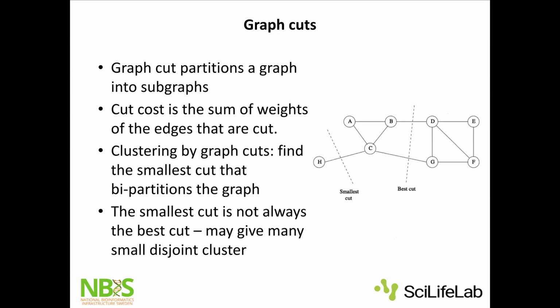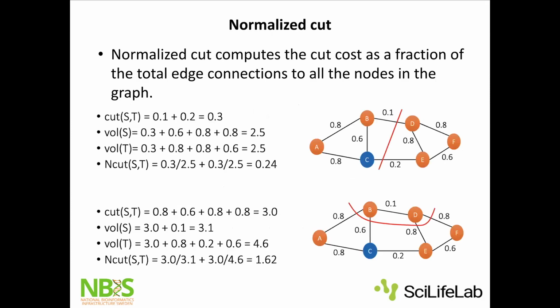Yes, we need to cut the graph. The cost of cutting an edge is basically the weight of that edge. And often the smallest cut will give a lot of disjoint pieces. It's easiest to just cut at the edges and get singular clusters. So that might not really be so informative.